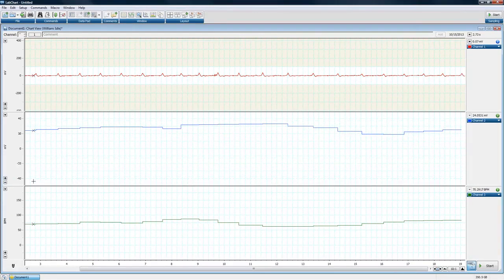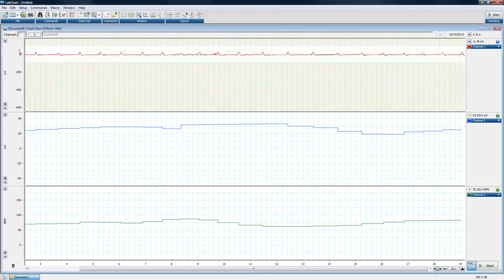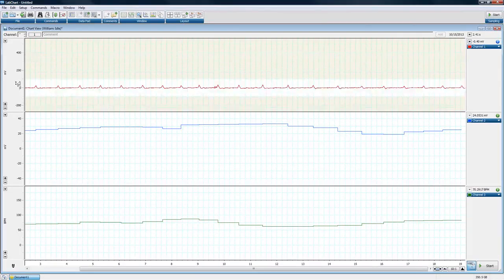The next way you can actually do this is using your mouse to directly manipulate the axes that you're seeing. So if I hover my cursor over the numbers on the y-axis here, I want you to notice that my cursor has another small cursor show up next to it. This one is a double arrow, and what that means is I can then click and drag everything up and down on the y-axis. So I'm dragging the whole y-axis up and down when I see that double arrow.